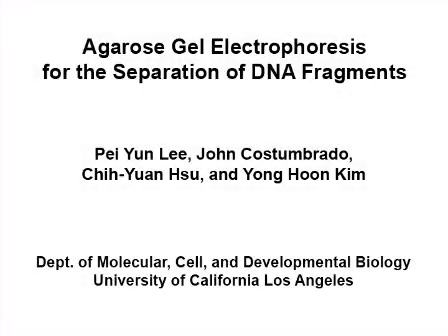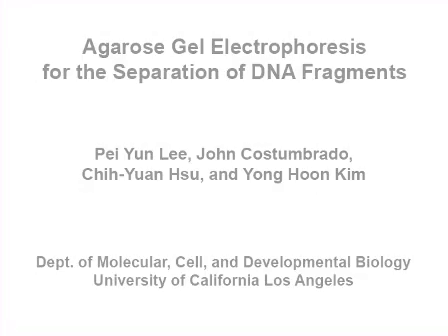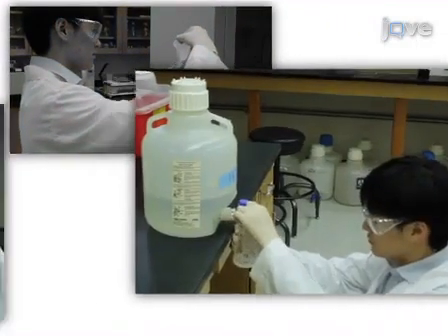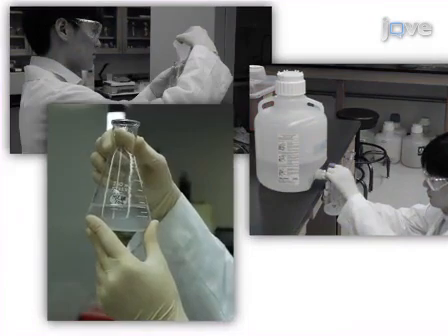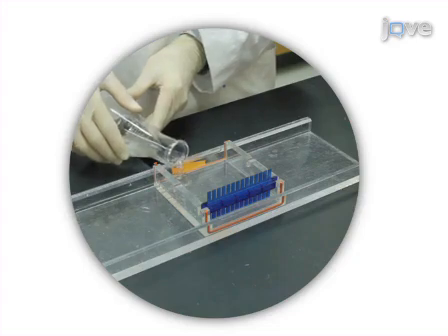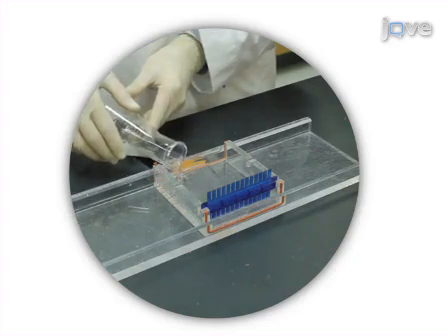The overall goal of this procedure is to separate DNA fragments of varying sizes. This is accomplished by first preparing a gel with the appropriate concentration of agarose and a fluorescent dye. The second step is to pour the gel into an appropriate mold and allow it to set.